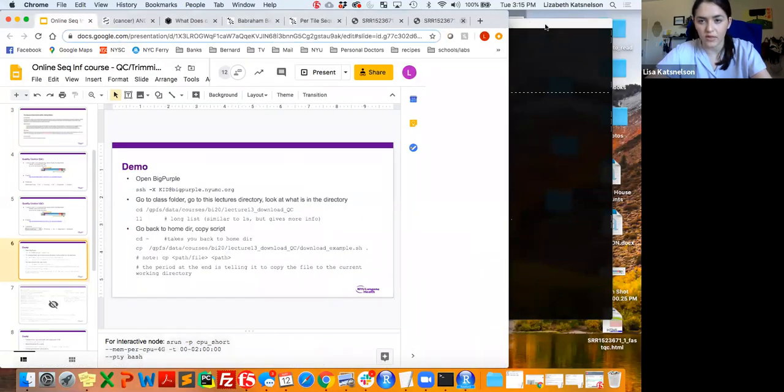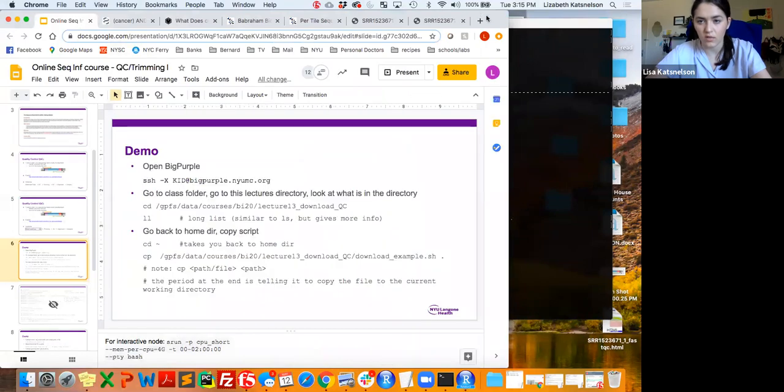So hopefully everyone is able to do that. Let me just check the chat. So is everyone able to, oh, sorry. If you want to exit Nano, you do Control X. Okay, hopefully everyone was able to get this far.